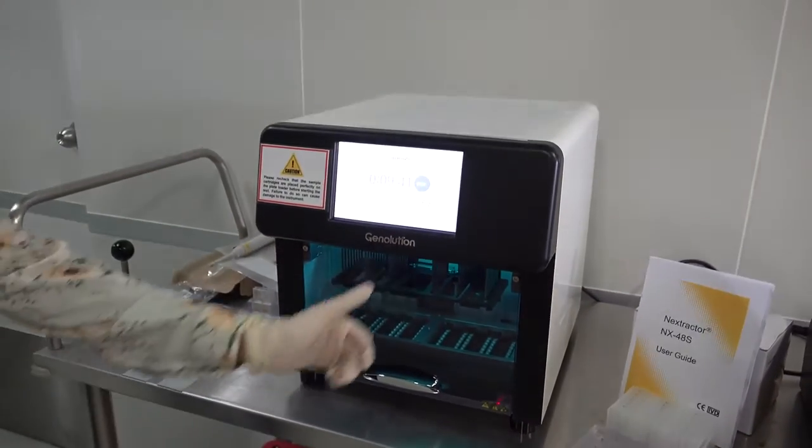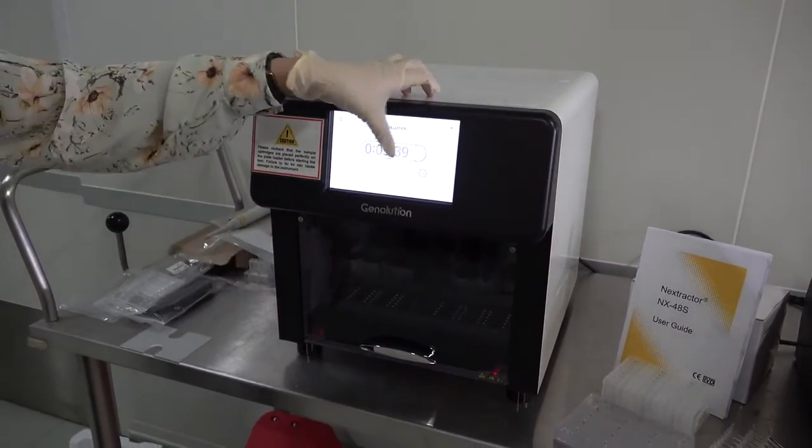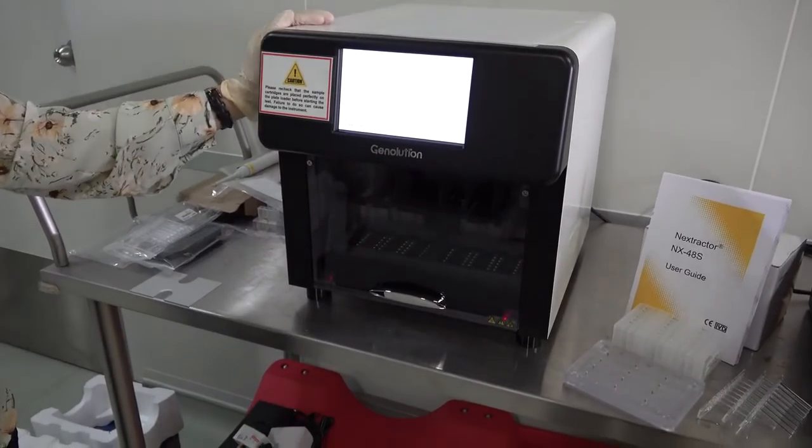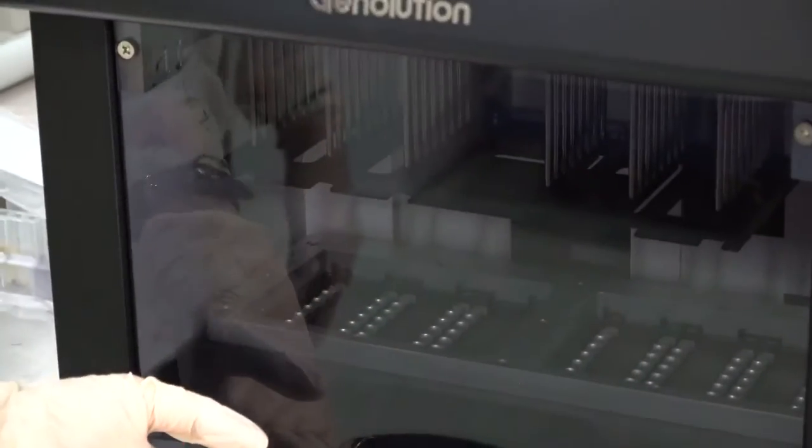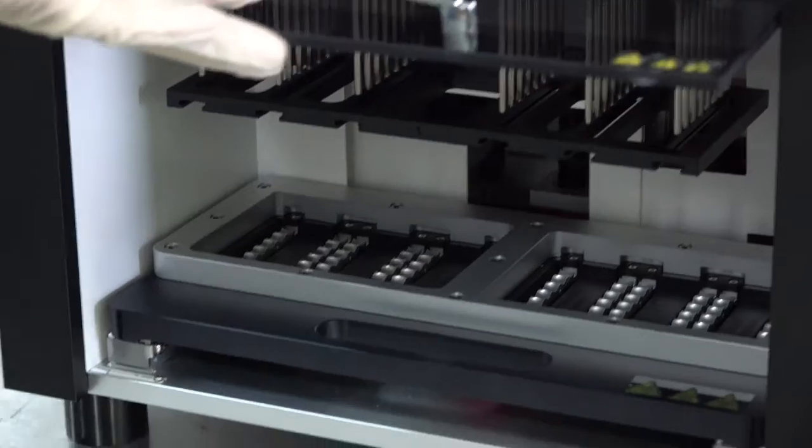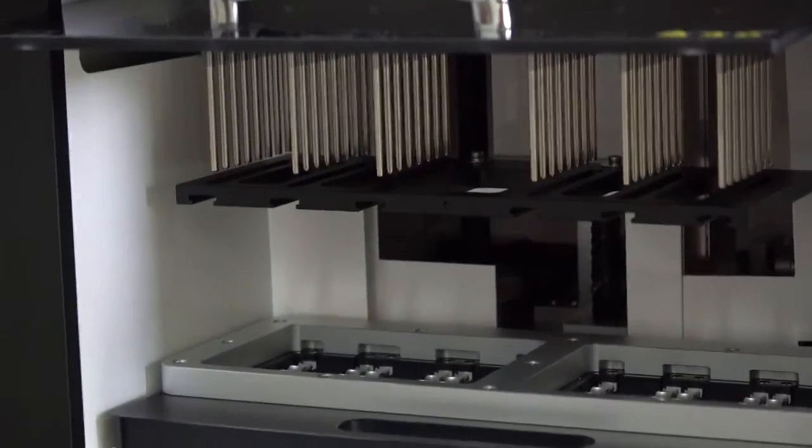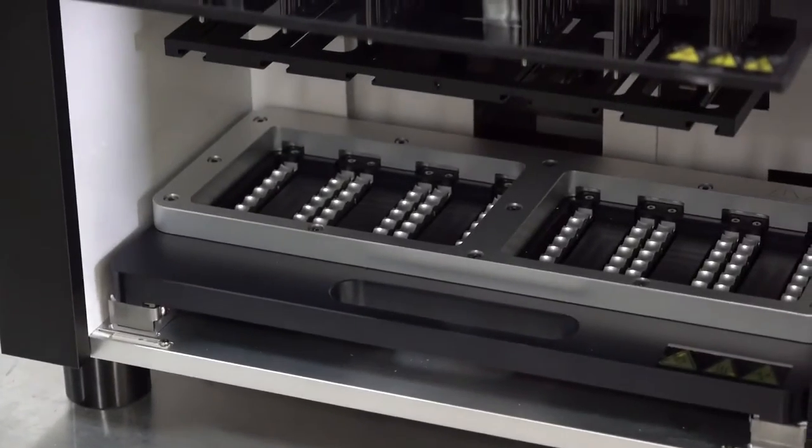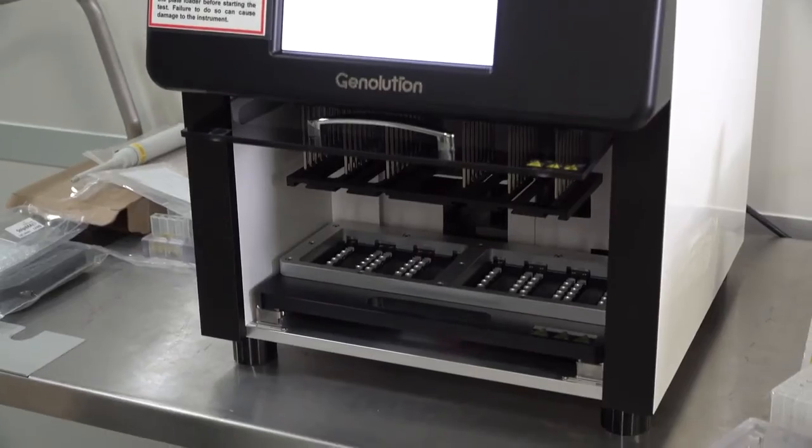The next procedure is basically the system setup itself. We will proceed to the system setup. As you can look into the unit, once it's open, you will see that there are some kind of magnetic spindles over here as well as a thermal cycling block. This is actually a heating block. Let's proceed to the first part which is the installation of the strips.